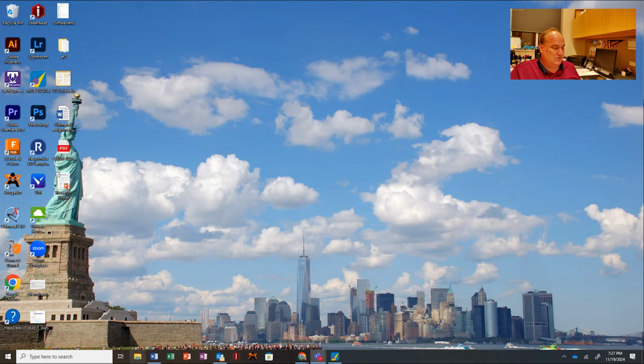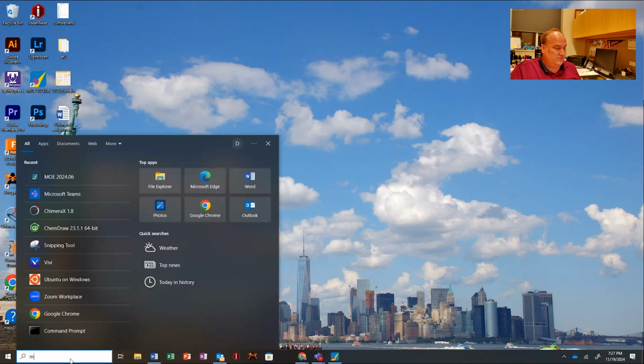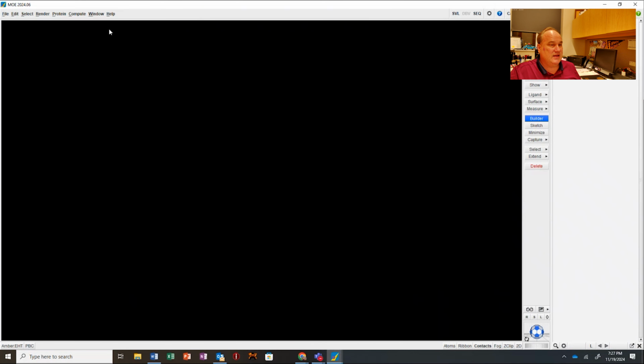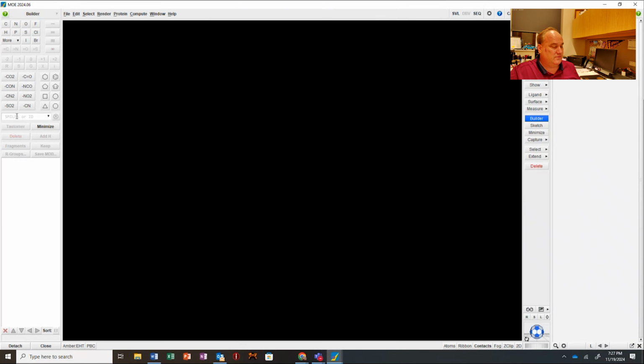And then let's go to my MOE file. And we go to Builder. We go to SMILES, and I hit Control V. There's my SMILES code. Here's where it wants to put the name with the complete SMILES code. I usually highlight that and make the name a lot more simple, right?